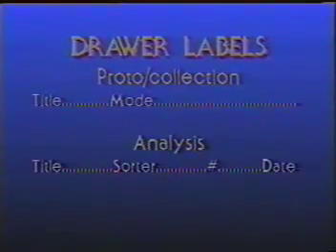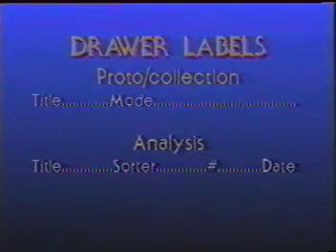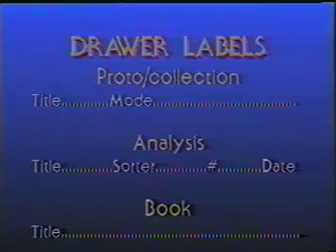In a moment, your desk appears on the screen, not as a three-dimensional desk, but rather as a list of the labels on the desk drawers. Each type of drawer can be distinguished by the format of its label. A protocol collection drawer label shows an experiment title and a tag indicating whether the drawer is in protocol or collection mode. Analysis drawers are labeled with the experiment title, the name of the sorter or analyzer from which the data was collected, a unique collection number, and the date on which the FACS analysis was run. Book drawers are simply labeled with a title.